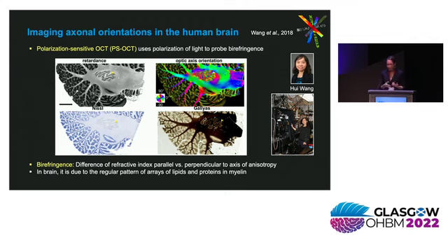And it's also helpful to be able to do this sort of quantification in the human brain directly. For this, we use a technique that's called polarization-sensitive optical coherence tomography, or PSOCT, which at the Martinos Center has been spearheaded by Hui Wang. It looked like this a few years ago. Now it looks much more civilized, the new system.